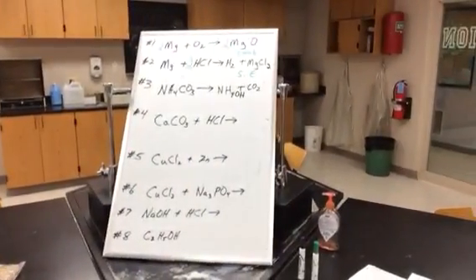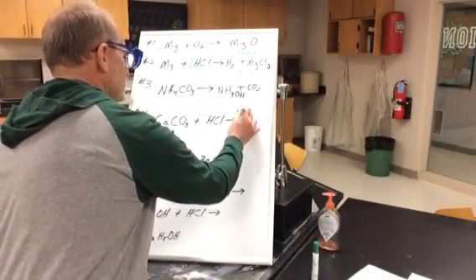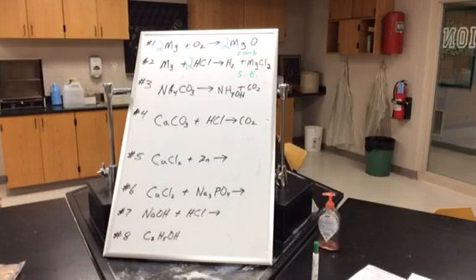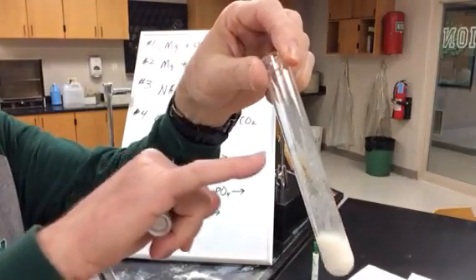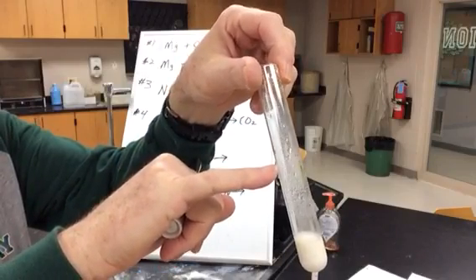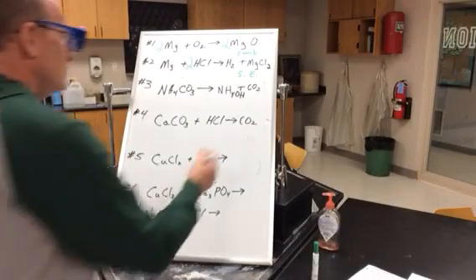So let's go over and check our chart then. So I know I would have CO2 gas being produced. Okay. Something else that may be a little tough to see here, but I think you can also see there's droplets up here. Okay, that got produced. Can you see those? That indicates we've got some water in the reaction as well.